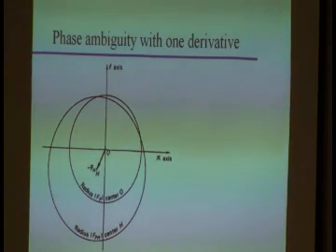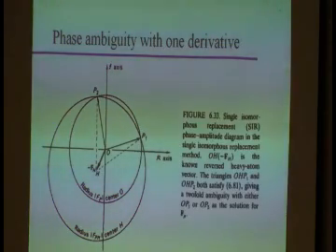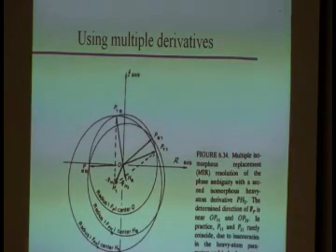How about we grow another heavy atom derivative and do the same thing? Because our chances of 3 circles having 2 common intersection points, not very high, right? So if we do that, we get something like this. Same thing as in the last slide.